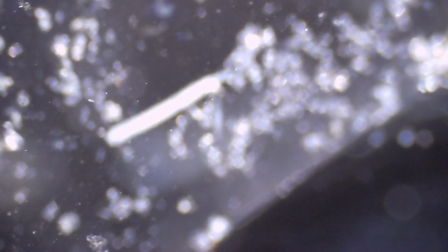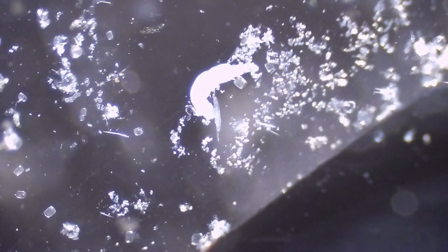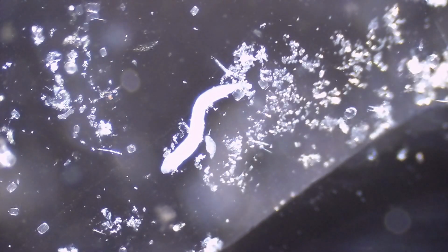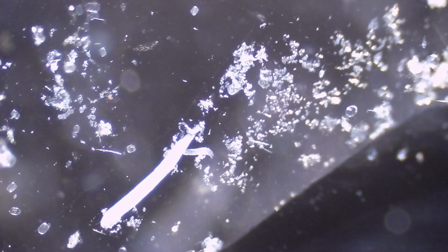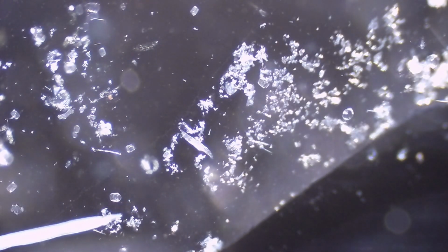You can see all types of stuff. Let's see if we can find that worm again and really see. Oh, here it is. Let's see if we can get in focus now. See, the head shape doesn't quite look like planaria, so I'm thinking it's some type of detritus worm. That would be my guess. But guys, if you know, drop it down in the comments below if you have a guess about what this could be.